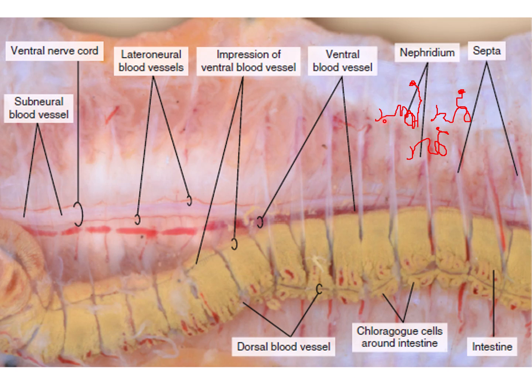The coelomic fluid enters the nephrostome and flows through the narrow tubes, and the capillary bed blood vessels run along this structure. The useful materials are reabsorbed, and the rest of the excretory waste goes out through the nephridiopore.